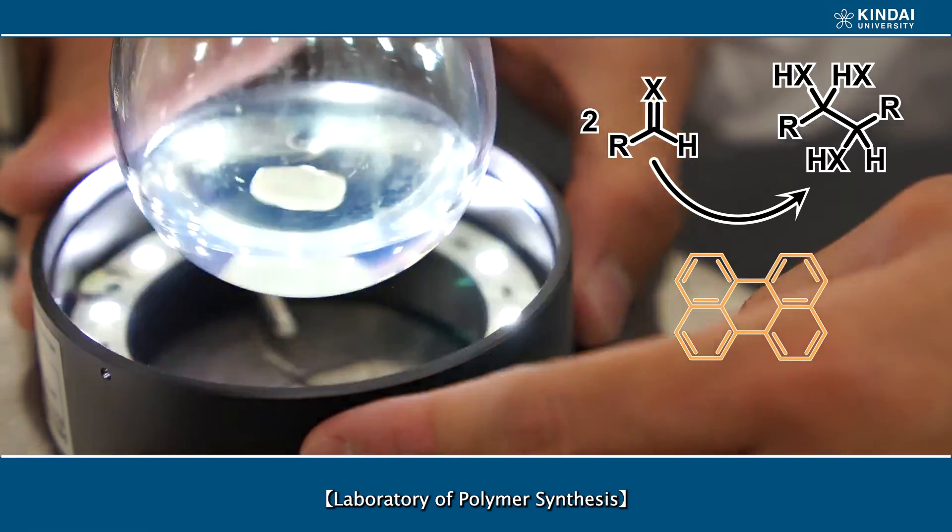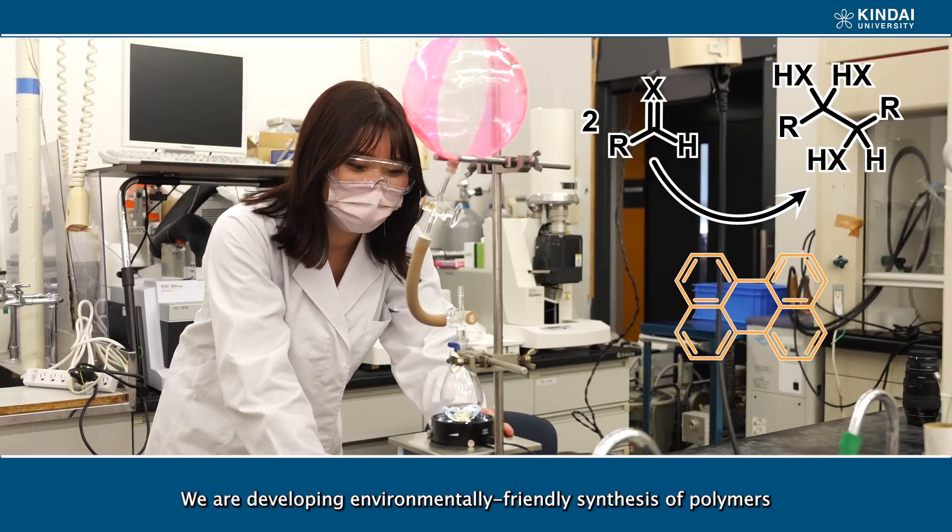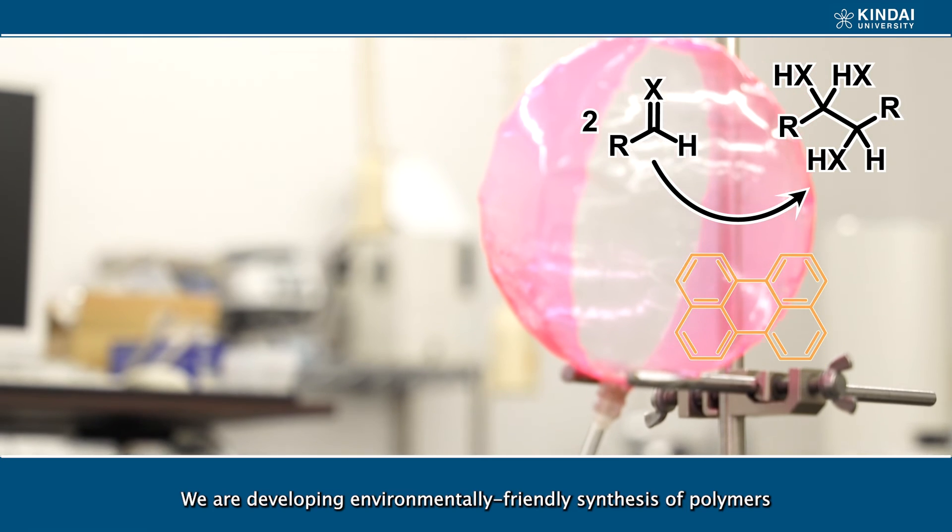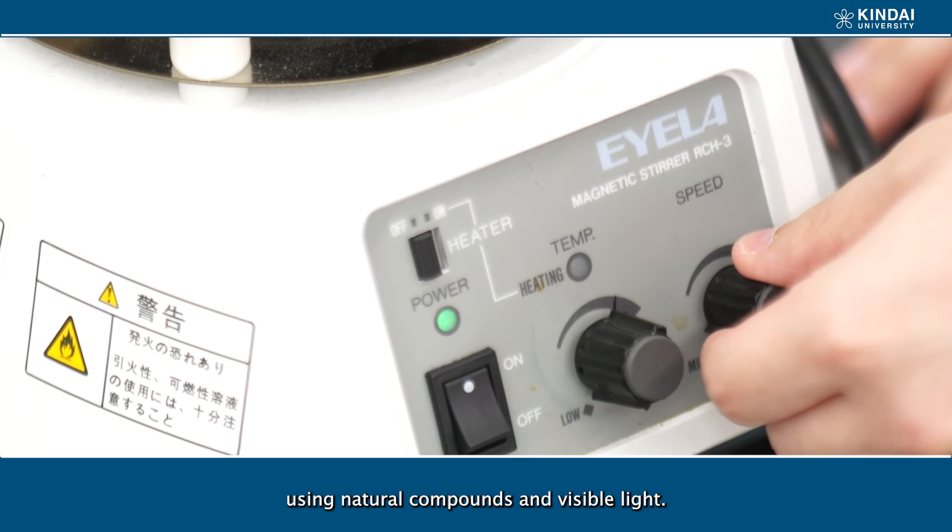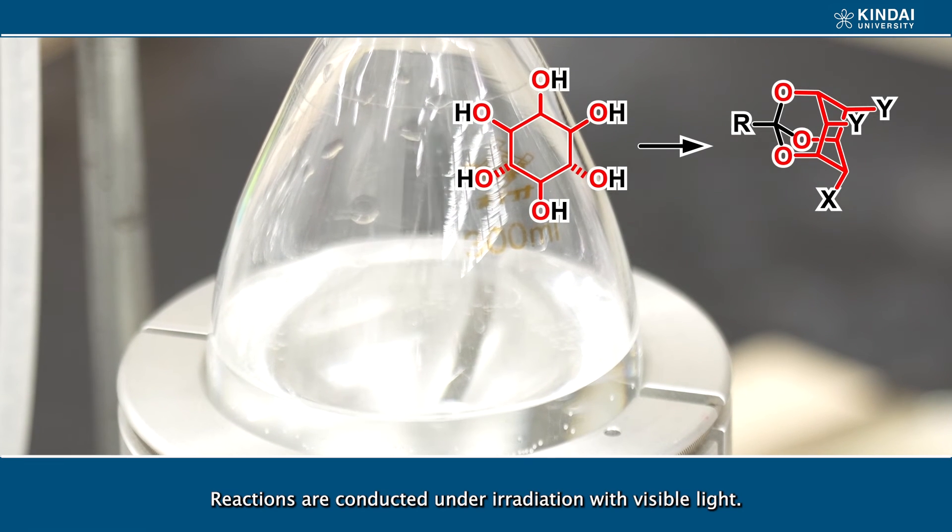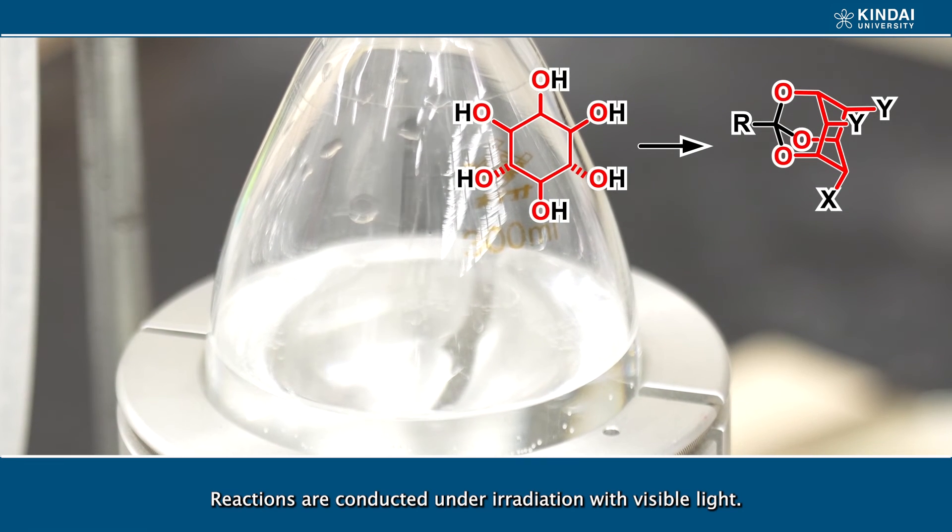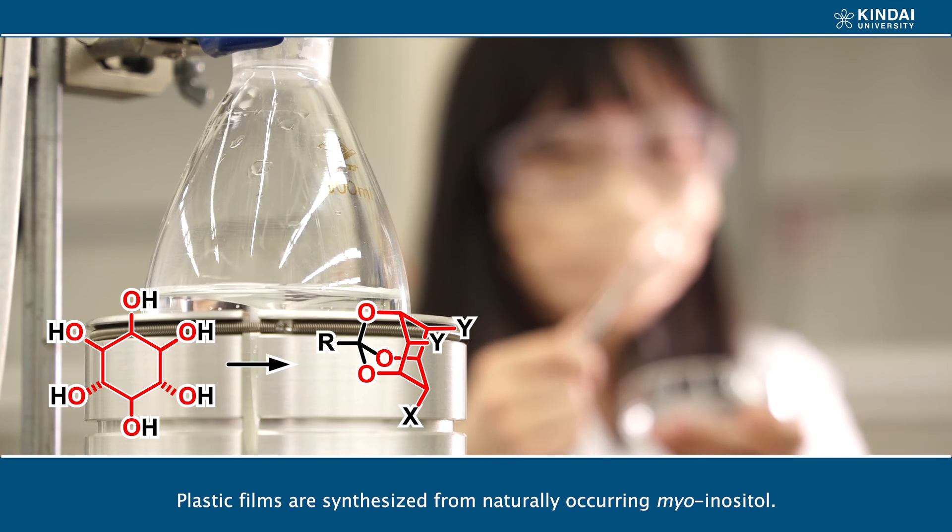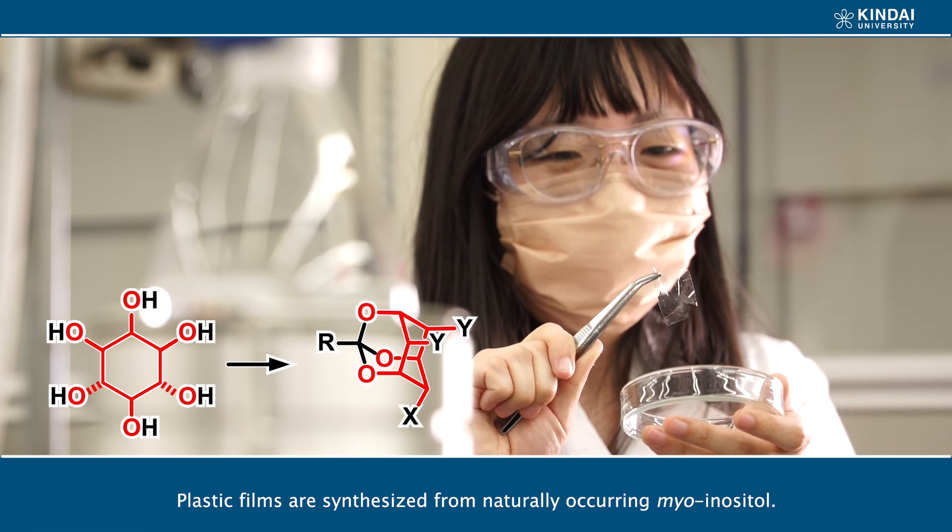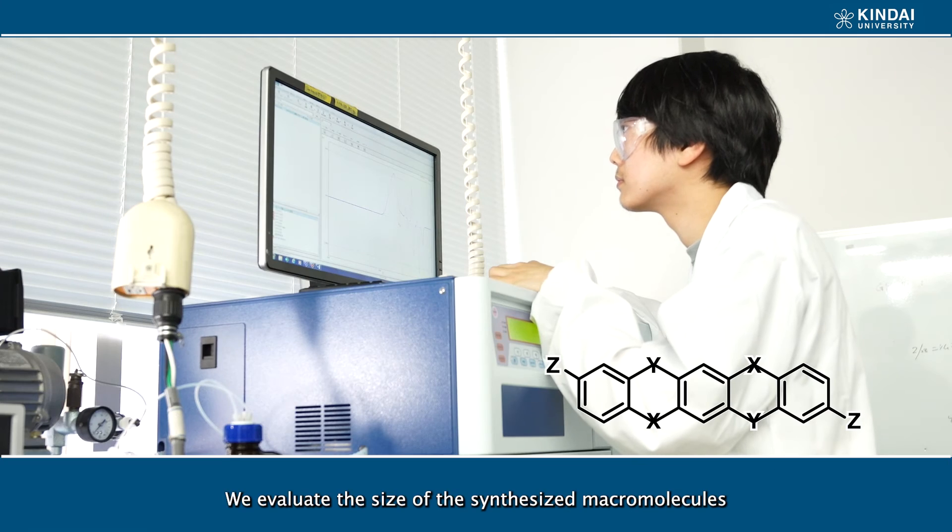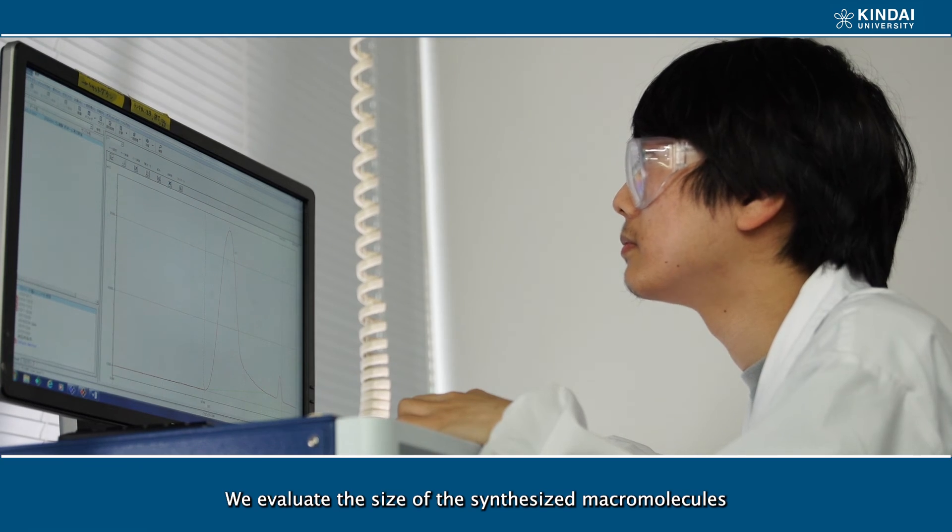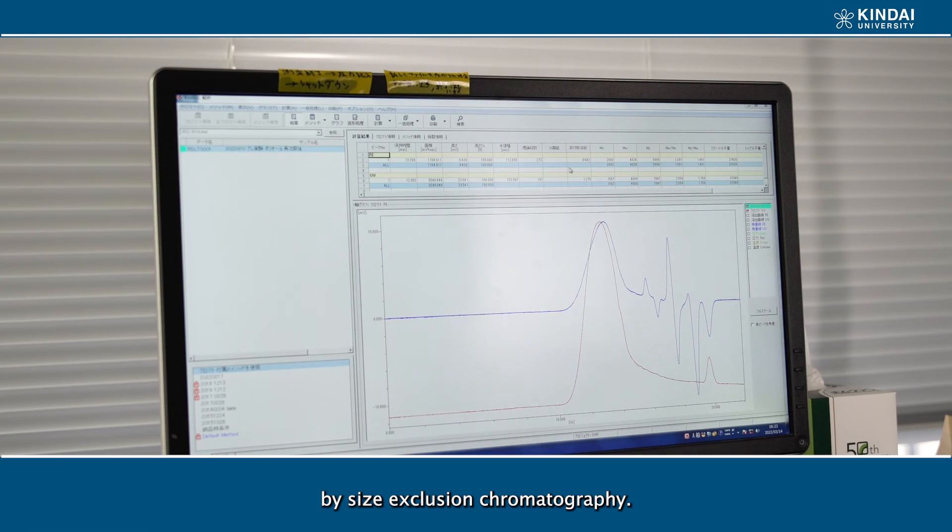Laboratory of polymer synthesis. We are developing environmentally friendly synthesis of polymers using natural compounds and visible light. Reactions are conducted under irradiation with visible light. Plastic films are synthesized from naturally occurring monomers. We evaluate the size of the synthesized macromolecules by size exclusion chromatography.